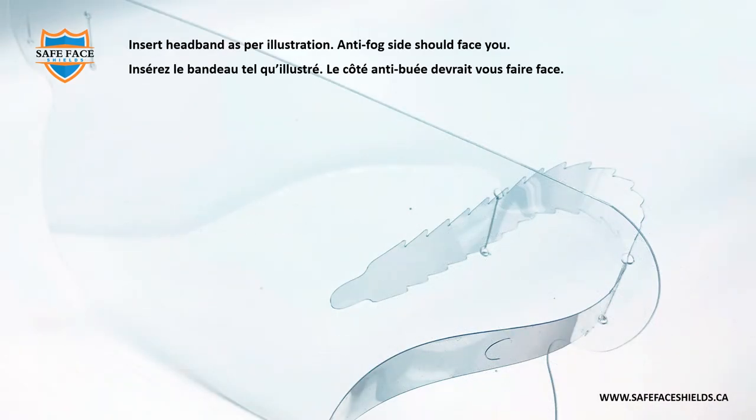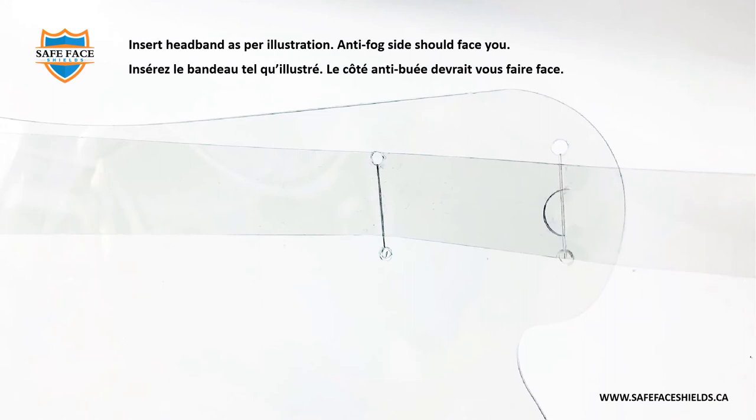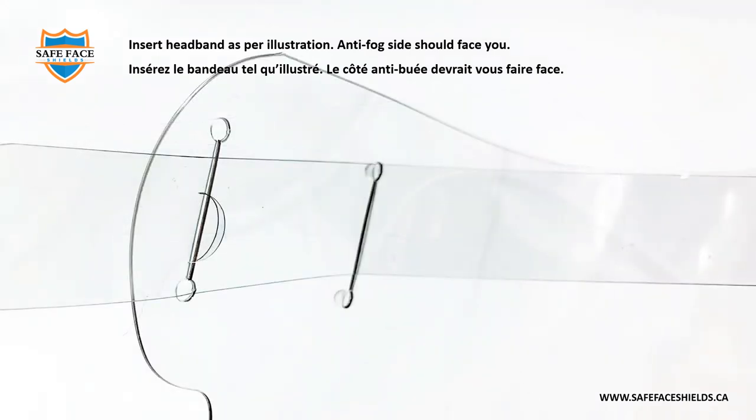Insert headband as per illustration. Anti-fog side should face you. Insérez le bandeau tel qu'illustré. Le côté anti-bué devrait vous faire face.